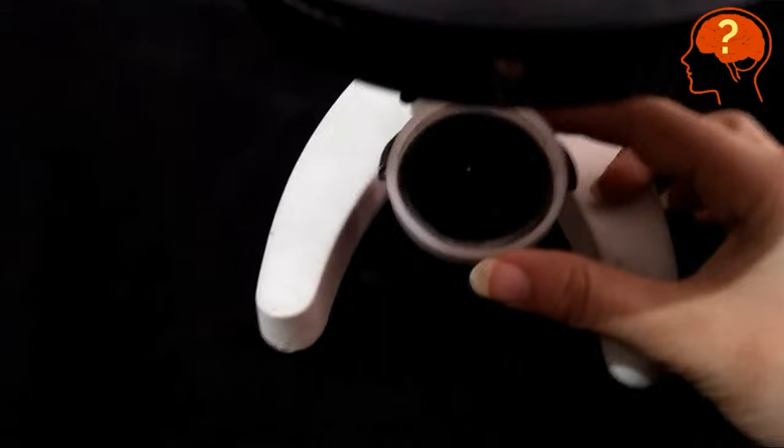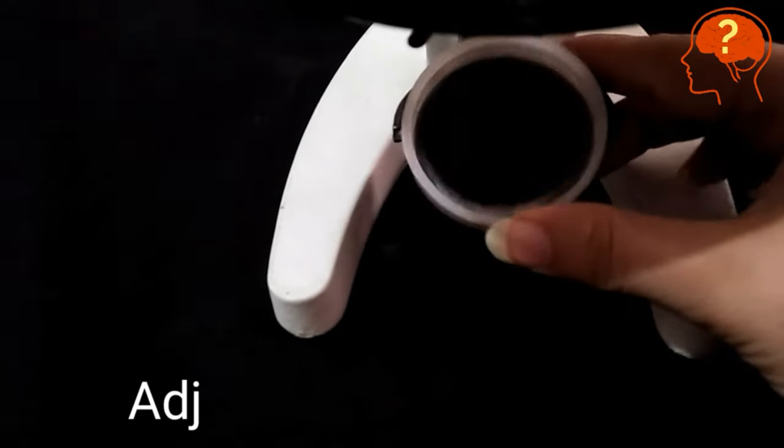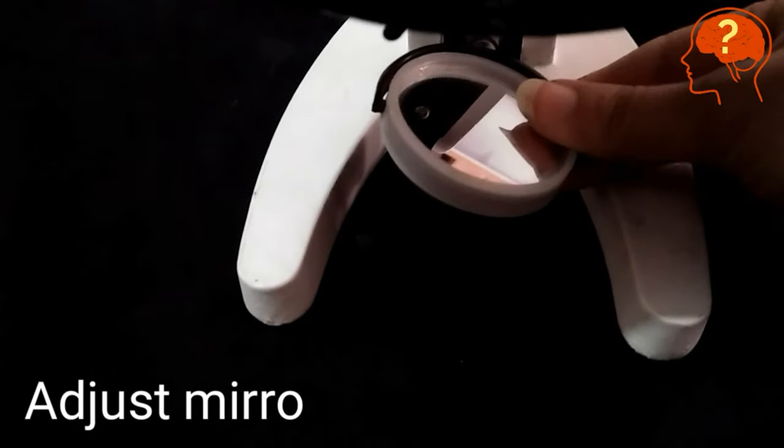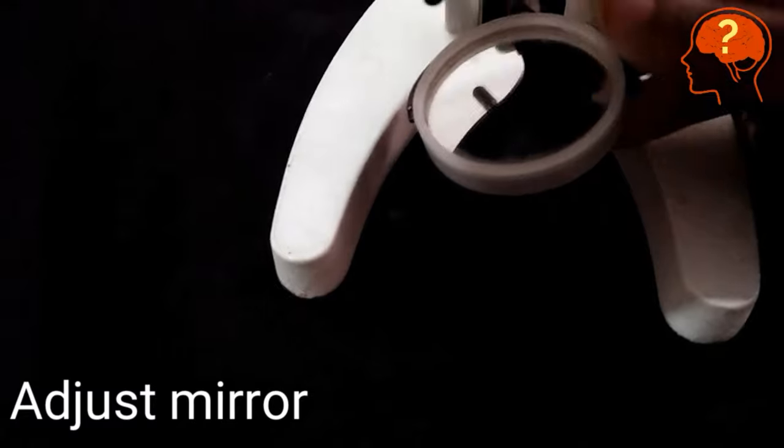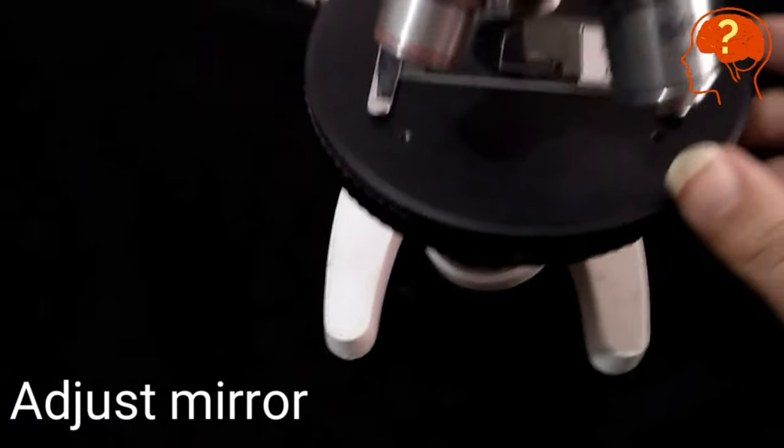When you place the slide, first you will adjust the mirror. You will move it from left to right. Where you know maximum light, you will set it.